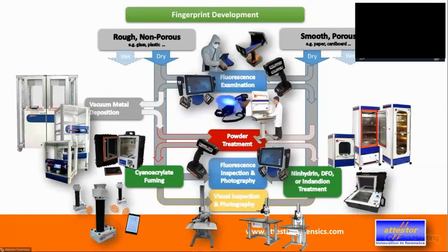And here in Germany, we have quite a number of forces that have so-called fuming rooms. That could be just something like the garage where they usually have their crime scene van parked in. And that's completely tiled all the way around, even the ceiling and everything, so it's possible to be spray washed afterwards. But more forces do actually have half of our fuming tent permanently set up in a garage, having the MEGAfume permanently set up there.